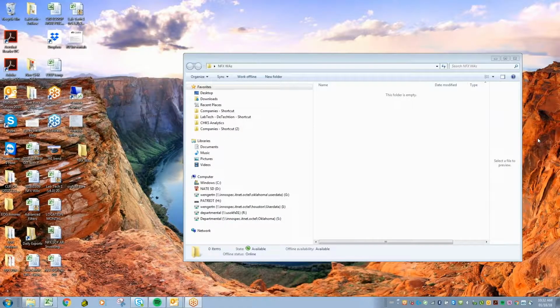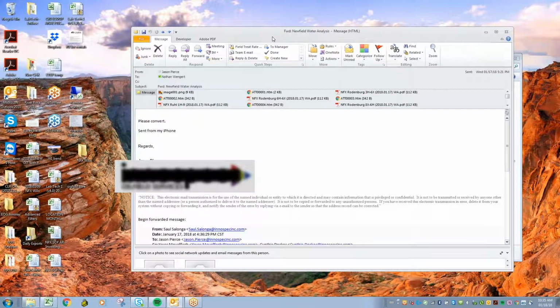This video will talk about analytical data. More and more they're requesting raw data. They don't want PDFs anymore. And I found a way to do that through an Excel program that will open a PDF, copy that data through send keys from Excel, paste it into a new tab, and the code goes through a lot of mess, sorts it out, and is able to pull relevant information into a spreadsheet. I call it the PDF to Excel.